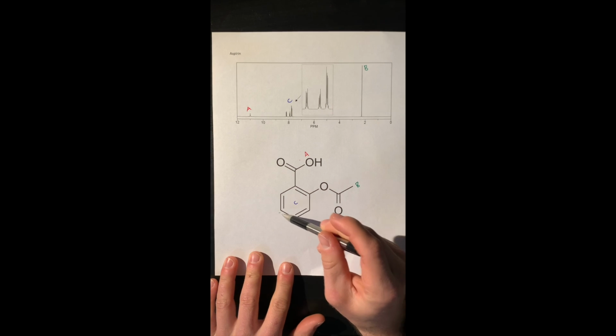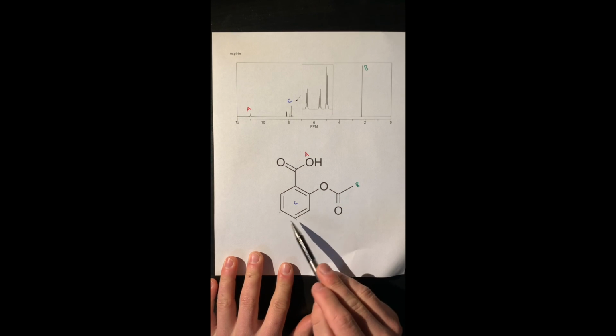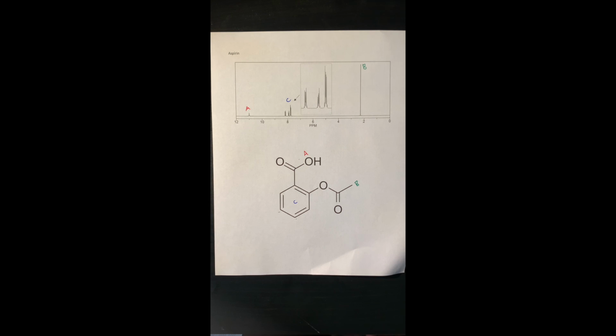So we can come to some conclusions about connectivity as well. And since we have a peak for a carboxylic acid and a peak for a CH3 attached to an ester, we know that this leaves 4 sites on the aromatic open for bonding. And since there are only 3 signals, we can conclude that 2 of these hydrogens, these 2 hydrogens right here, are equivalent, so that they're only going to give off 1 signal each.